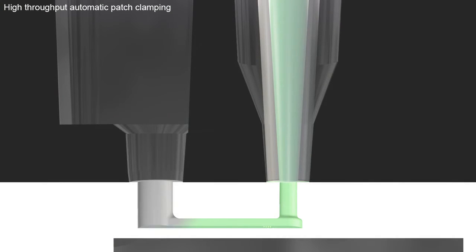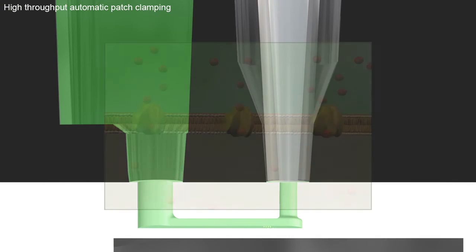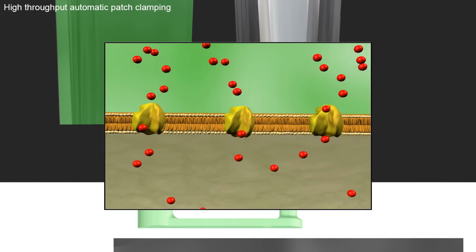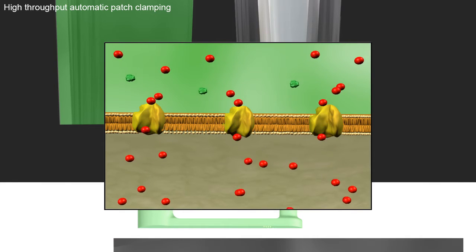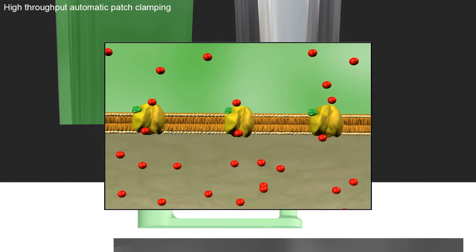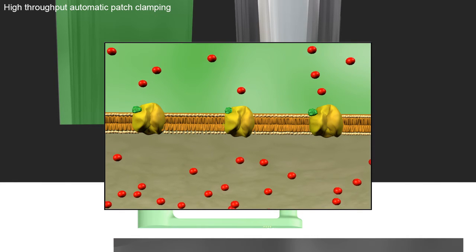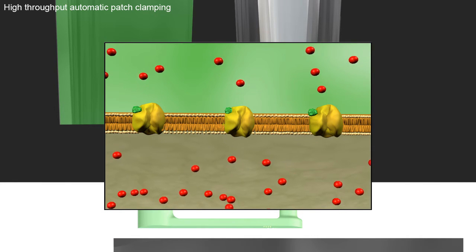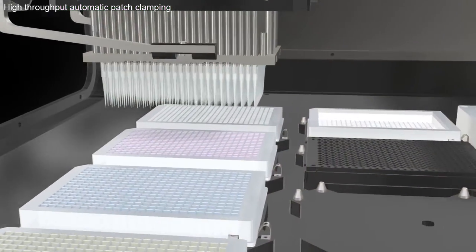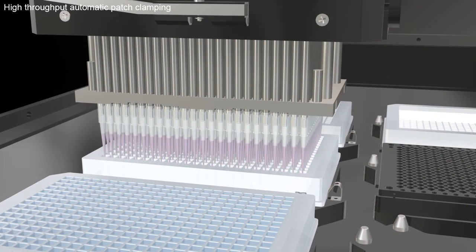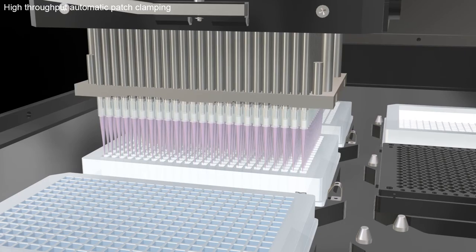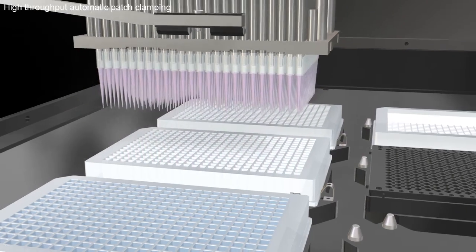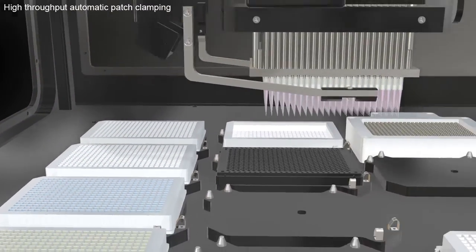Test compounds can be added and removed in a continuous fashion with complete wash-in, wash-out functionality. This feature enables Qube to perform concentration response experiments as well as testing different compounds on the same site.